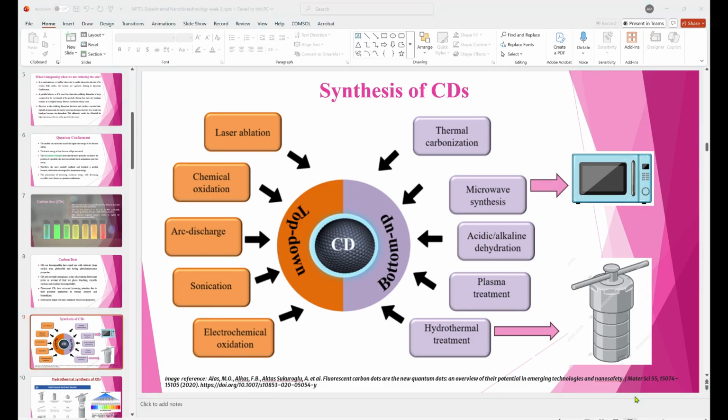Okay, so in hydrothermal, you can see this is the hydrothermal synthesis reactor. So in the hydrothermal synthesis reactor, what do you have? You have the reactor body, you have the reactor cap, then you have a locking rod. So basically, you can see the rod goes inside, and then you tighten the lid. You have to tighten the lid, so that the pressure is maintained inside. Then you have the hydrothermal synthesis reactor chamber cap, and you have the hydrothermal synthesis reactor disk. The cap is the one which is screwed onto this reactor body, and you place a material in this.